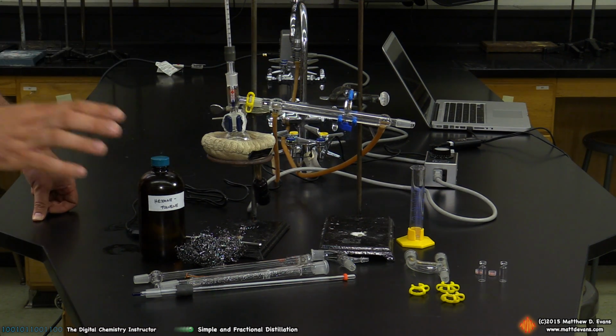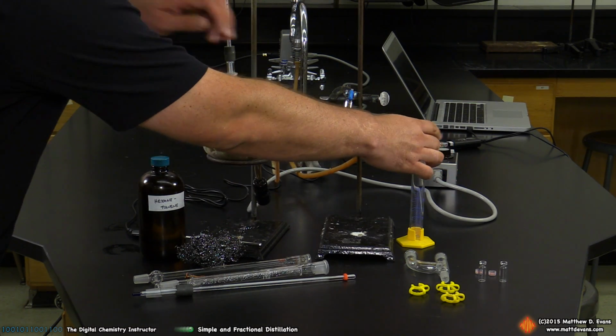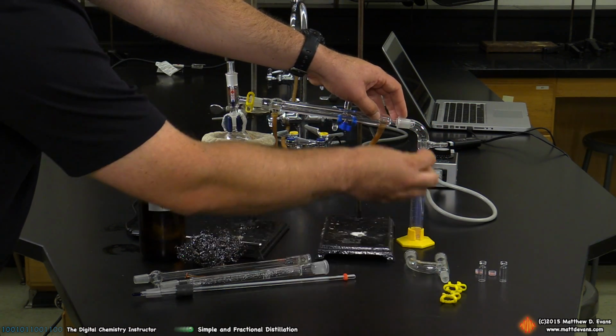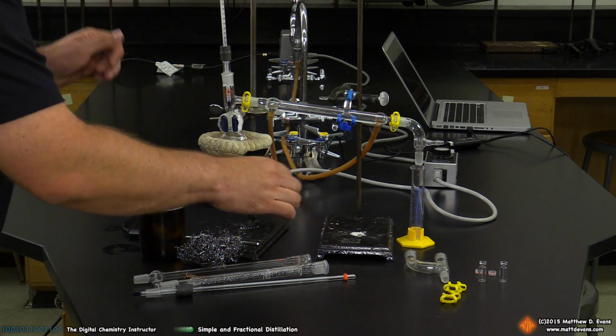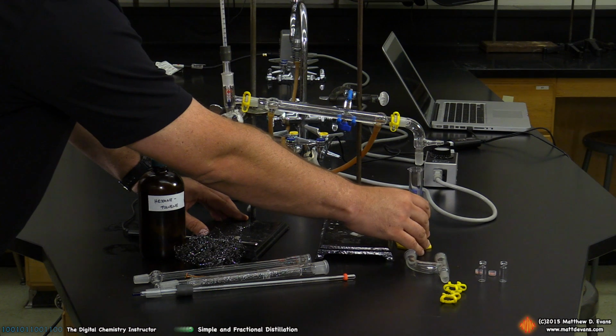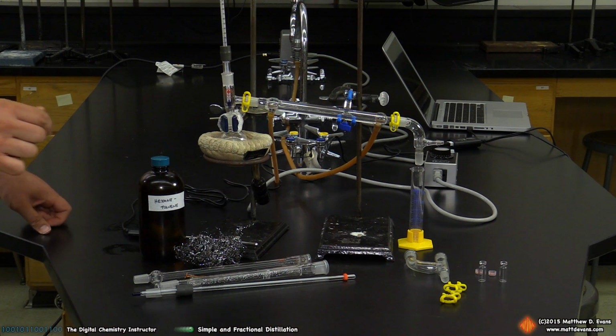The procedure will also call for a dripper tip, and that's simply to guide the distillate into the graduated cylinder. So we're going to clamp that as well so it doesn't fall off. All right, so we've got this all positioned just right so that it's going to drip right into that graduated cylinder, and we're not going to miss in our little collections.